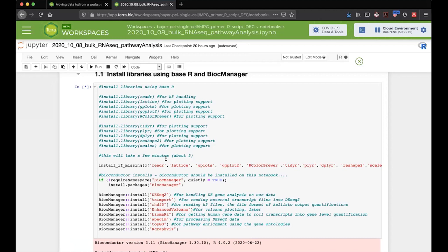If you're not familiar with Bioconductor, it's a really great resource. It's a really great community of people that work predominantly on analysis of biological data. And this is everything from microarrays to methylation sequencing, all kinds of stuff in R. And so this Bioconductor is installed on this version.